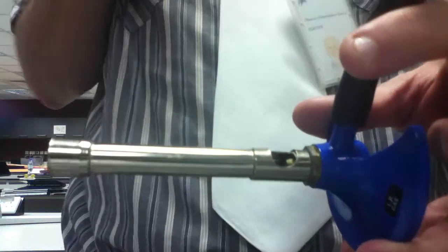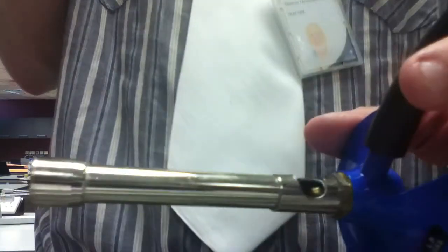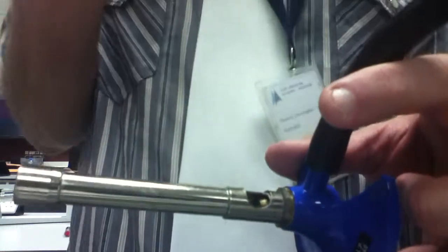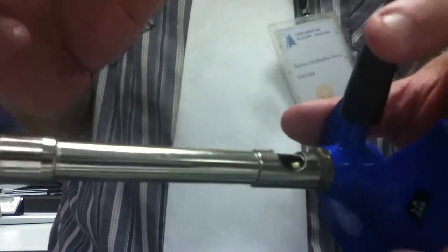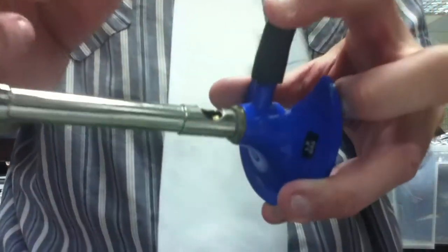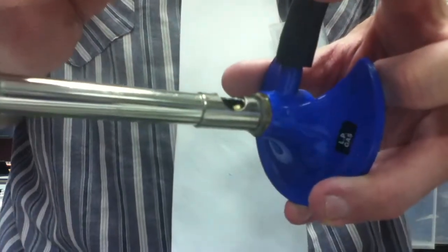Does anybody know what color the flame should be? Blue, almost like a cyan blue, a light blue. Okay. Not only should it be blue, but there should be a double cone, and I'm going to show you what that means. There's going to be an inner cone and an outer cone, and you're actually heating the object with the inner cone. Let me show you what that means.